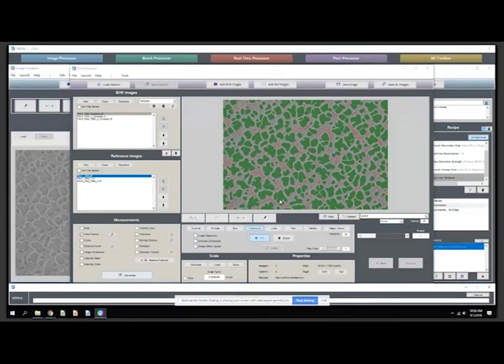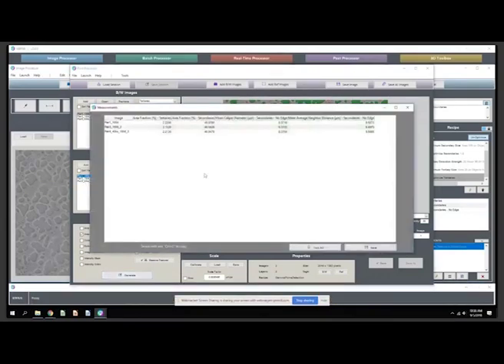Click accept, and now all 3 images are going to be measured as you've requested. When we get area fractions, mean particle size, mean particle spacing. Copy this and paste it into a report or save it directly into an Excel sheet. And there you have it.